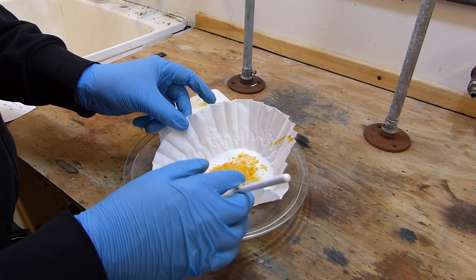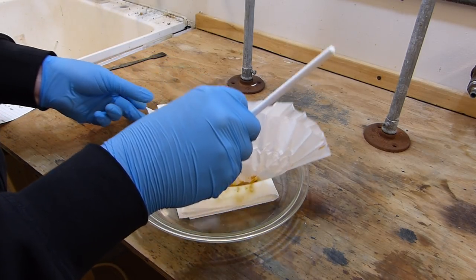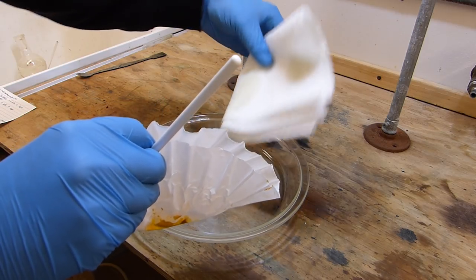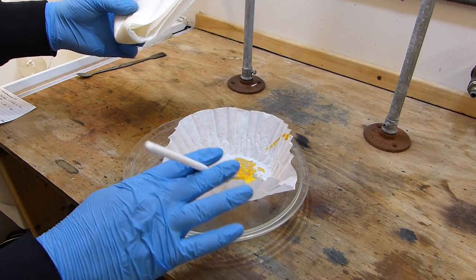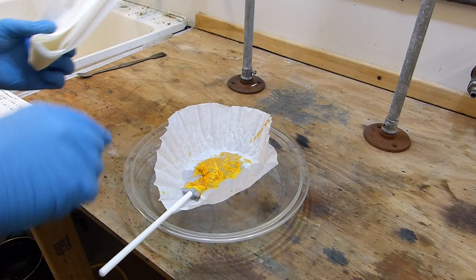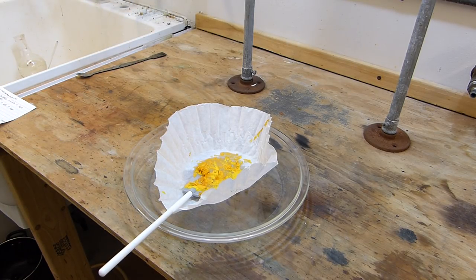So the paper towels have pretty much done their job so I'm going to go ahead and fold this back up. This gets disposed in the heavy metals waste. This goes directly on the glass pan and I'll get a hot water bath going to heat that up and dry it to a powder.